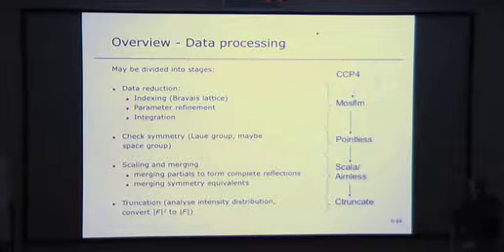I've seen images from a small synchrotron in the southeast of France where all the useful information in the image headers was wrong. So the beam center, the distance, the wavelength was all wrong because what they'd done is they'd moved a detector from one beam line to another and nobody had bothered saying, hey, let's update the headers. And it's only because the user had actually written down the numbers that we were able to rescue the data. It doesn't happen very often, but it does happen.